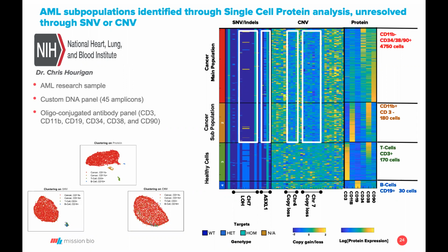Great. Do you plan to add epigenetic information to the list of readouts? Yeah, I mean, we would love to. We would love to add everything. At this point, we are all focused on DNA plus protein, probably intracellular proteins in the future. Epigenetics, not that I know of in the immediate future, but definitely we will look at it, same as with other analytes as well.